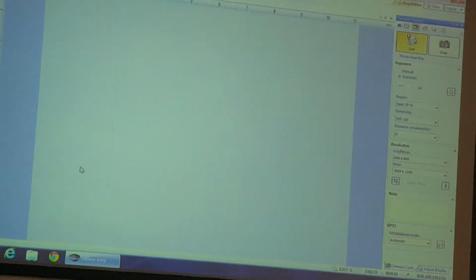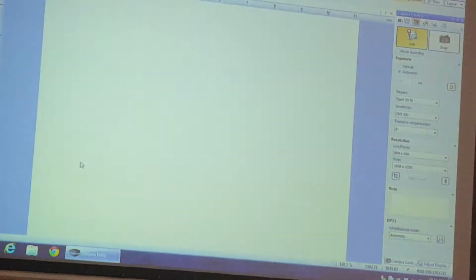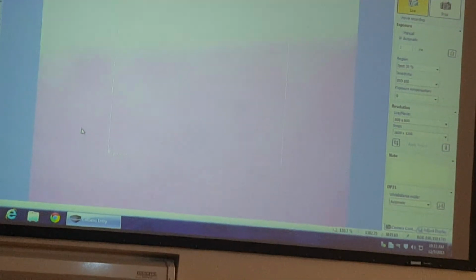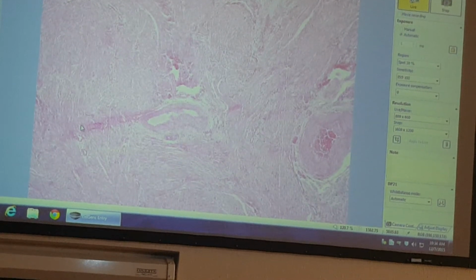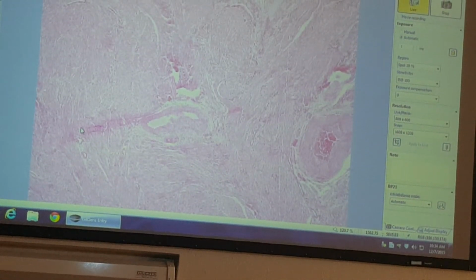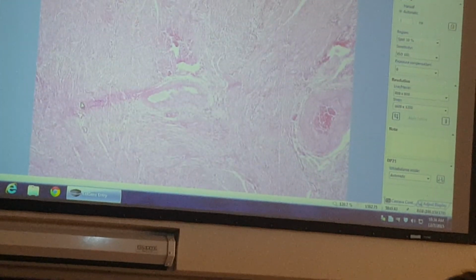And one more. Last one. Uterus in the secretory phase. This is days 14 through 28, so what we're looking at here is post-ovulation. The ovary has already released a secondary oocyte stalled in metaphase 2 out of the Graafian follicle, and therefore the uterus is getting ready for implantation. So, let's go back to the surface.